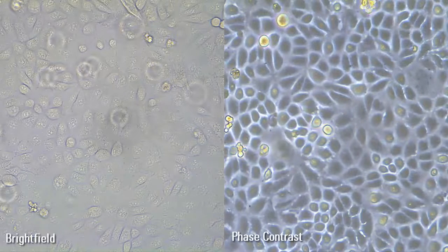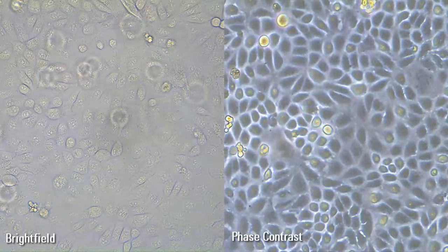MDCK cells are polygonal in shape when in the log phase and grow as a monolayer. They are difficult to see with normal brightfield illumination. By switching to phase contrast the cells can be identified more easily.